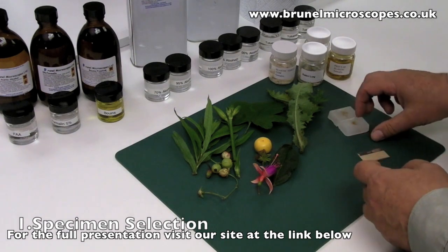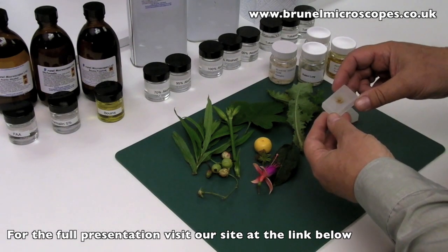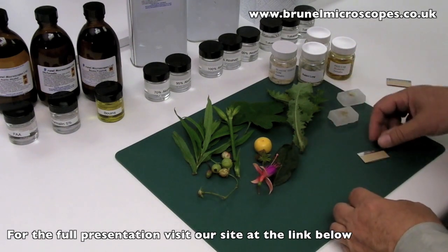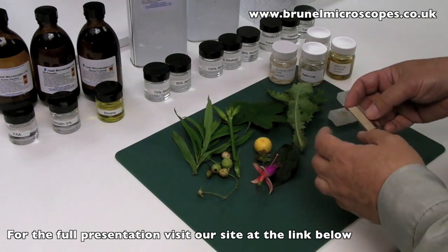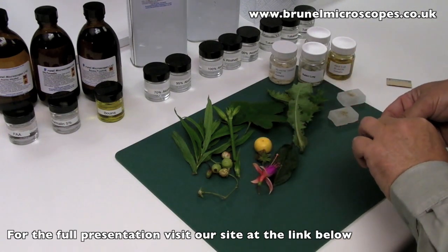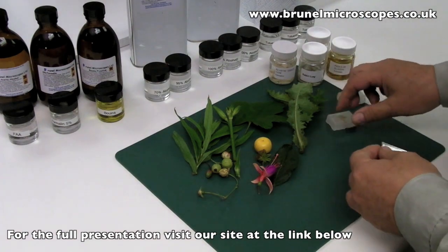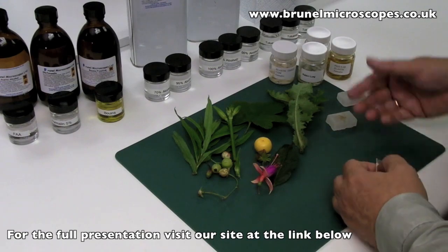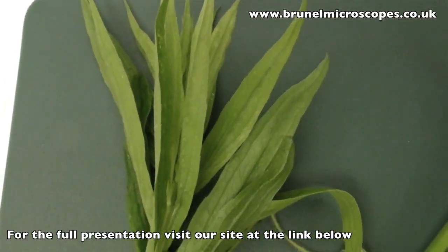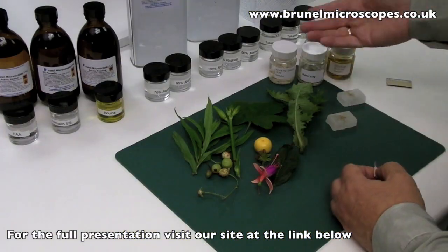This part of the presentation demonstrates how to select pieces from gross specimens that will eventually end up in a paraffin wax block. The choice of these pieces depends very much on the type of finished section you would wish to see. Once selected, the material has to be preserved by fixation, and we will deal with the choice of fixative later.